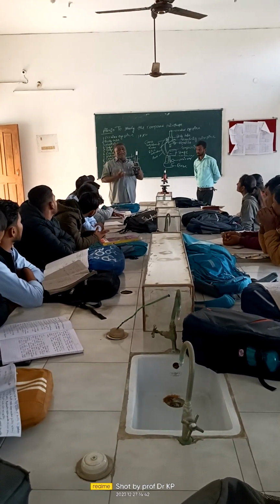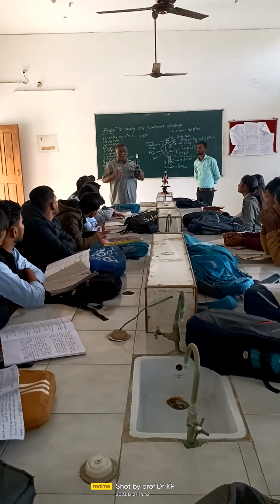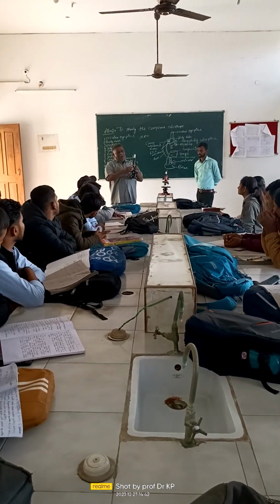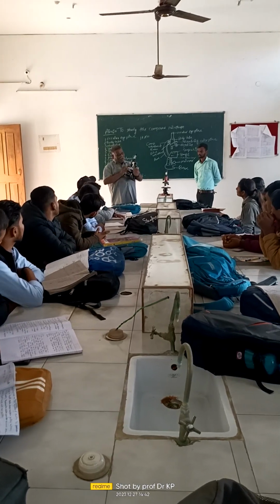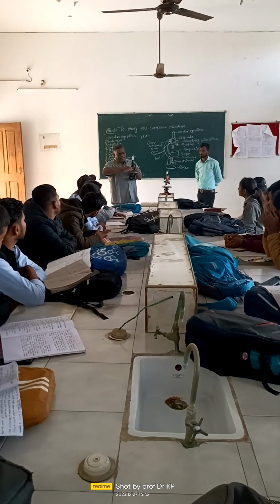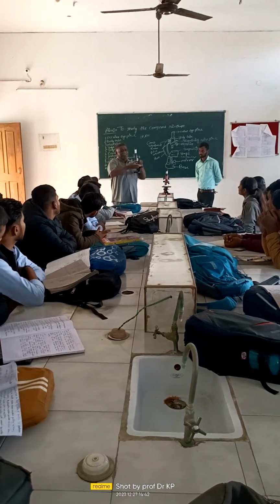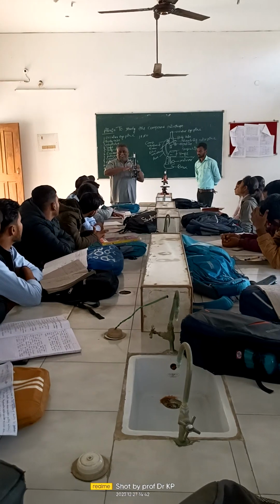Without hearing the click sound and not placing the nose piece properly, nothing will appear. Only a dark surface will appear. Clear? Now, the nose piece, as I told you, has maximum 10x and 45x, low power and high power. It should be written on the lens so that you will be able to identify the lens and the correct lens can be chosen, and with the click sound you can confirm whether it is in place or not. And then it is called the stage, on which the slide will be placed.